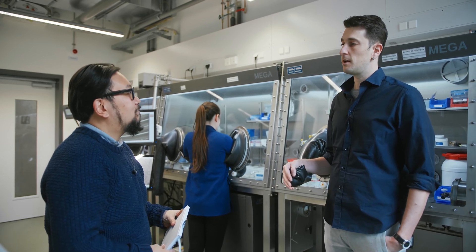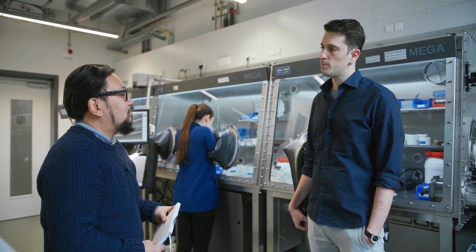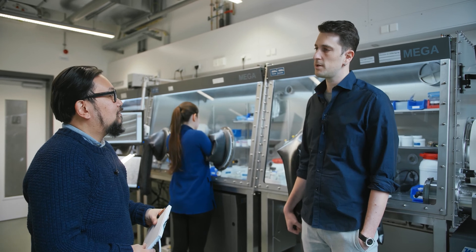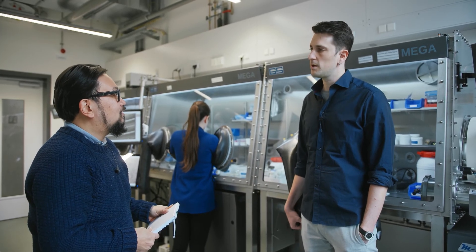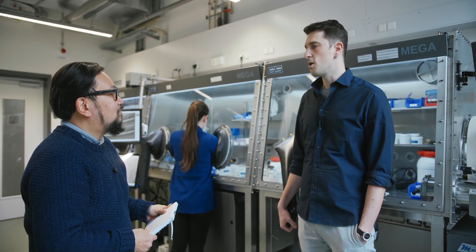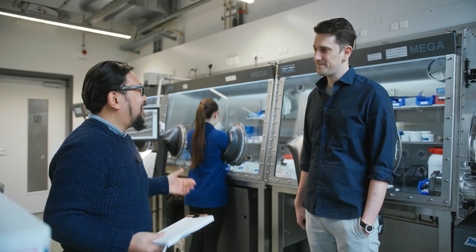So what is the process of preparing a battery for analysis in here? We have to open the cell and make sure that the electrolyte is getting out, so we wash them, and we do it inside the chamber to prevent any oxygen reactions with the battery material inside. So we actually cut it, wash it, and then maybe do a little bit of analysis in there? It depends on what we are looking at — we can use the microscope already in there for a first look, or we do further preparation in the microscopy lab. Can we see that? Sure, let's go have a look.